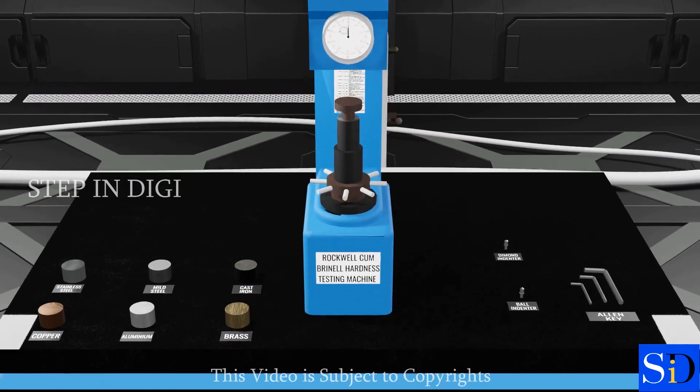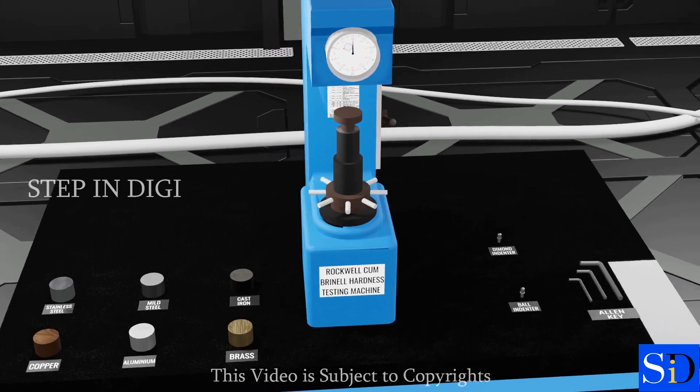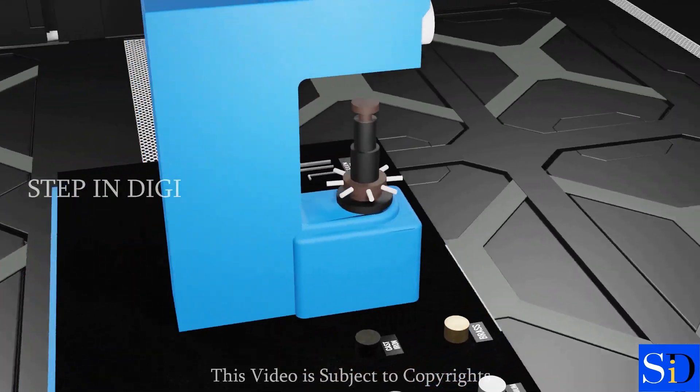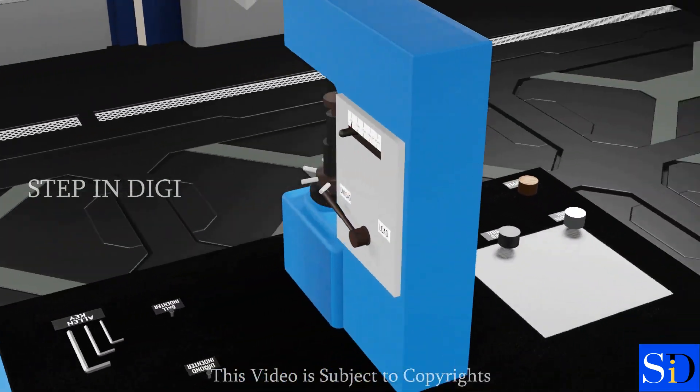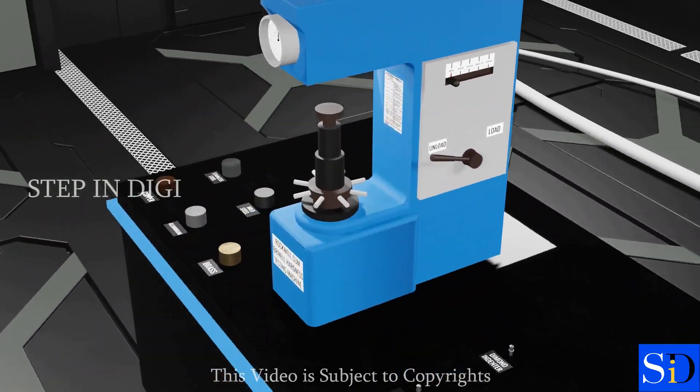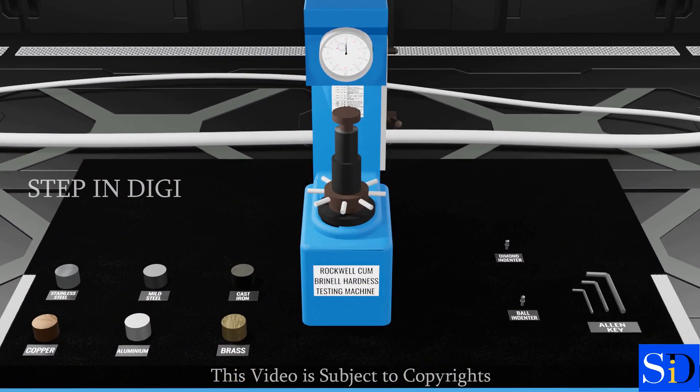Hugh M. Rockwell and Stanley P. Rockwell co-invented the first tester and a patent was granted in 1919. The Rockwell Hardness Test is generally considered easier to perform compared to other methods such as Vickers or Brinell.